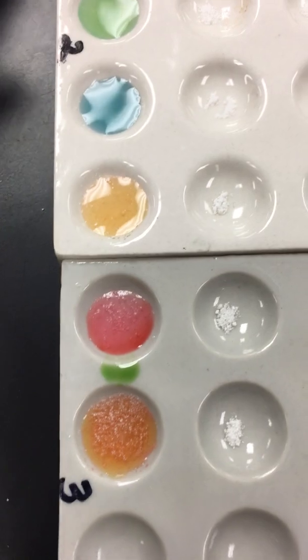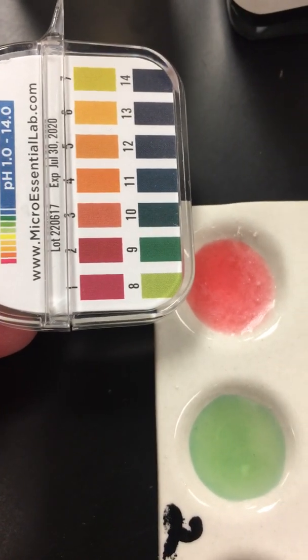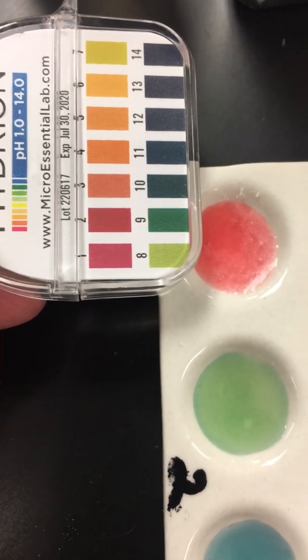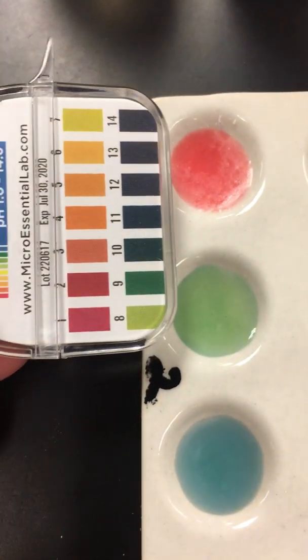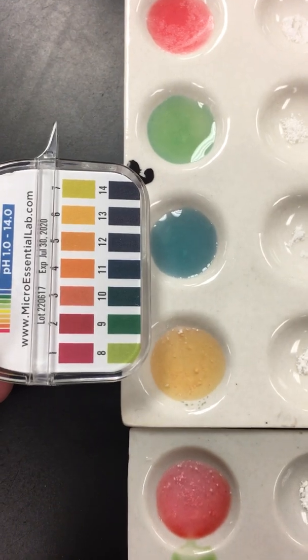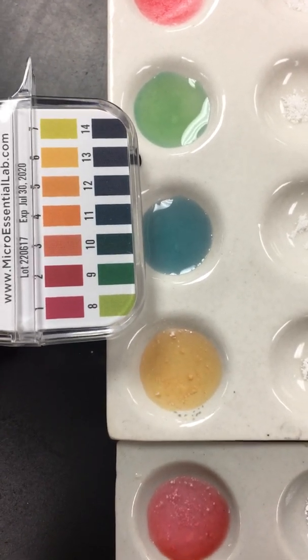So now we're going to compare the colors the best we can to our chart. I think that this first one looks like probably close to the 1 or 2, somewhere in there. This one is between the 8 and 9, but closer to 8. This one's not really these dark blues, but it's definitely maybe in that 10, 11 range.